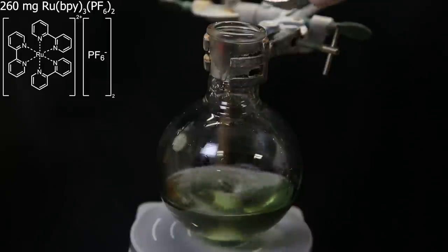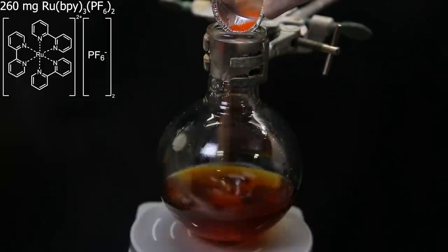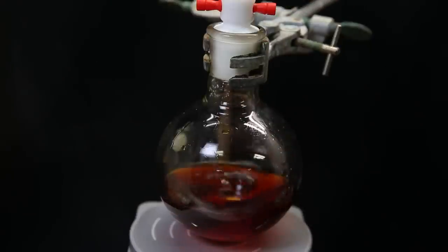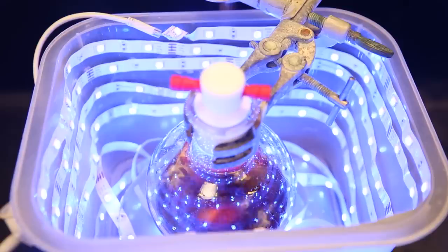And as the final ingredient, the hexafluorophosphate salt of the ruthenium bipyridine complex, which will serve as the photocatalyst, which colors the solution dark red. Now that everything has been added, I can start the reaction. So I lower the flask into the photoreactor and let it sit there for 2 days while stirring. I cover everything in aluminum foil to trap the light, and then leave it to react.